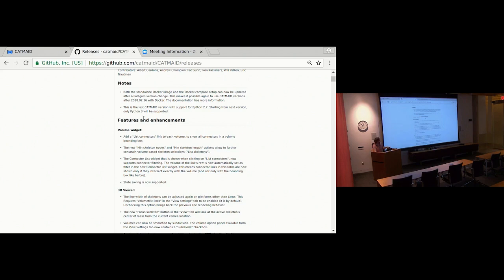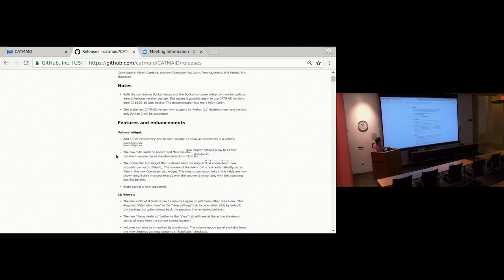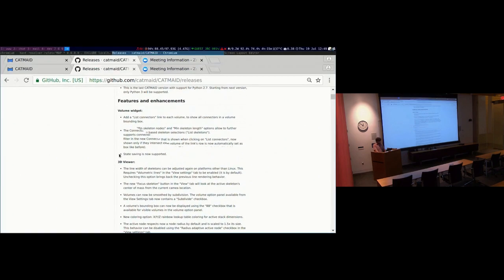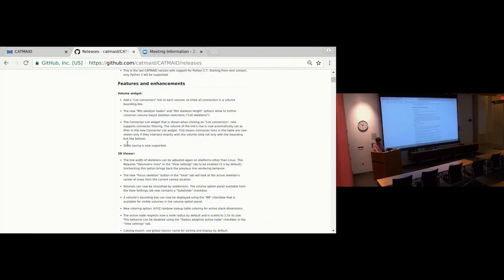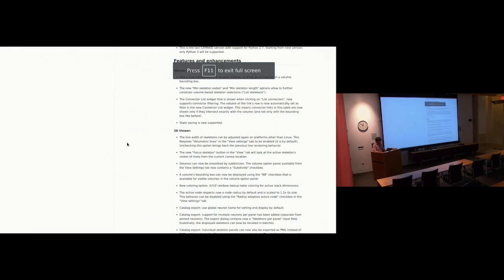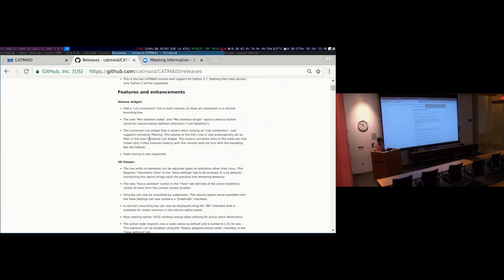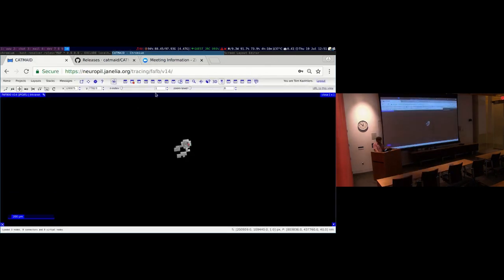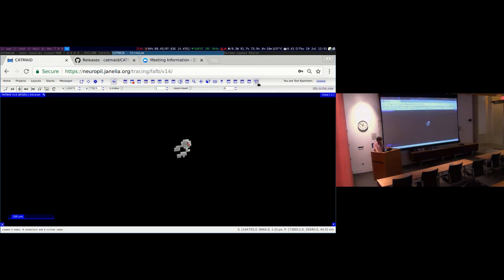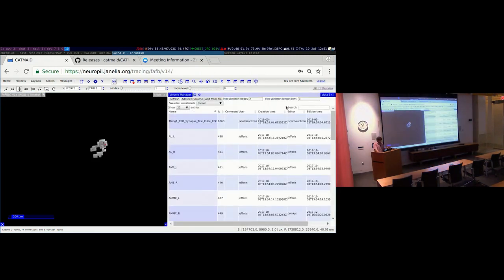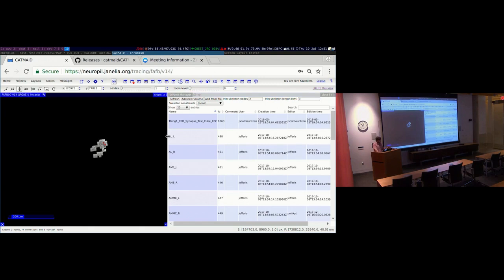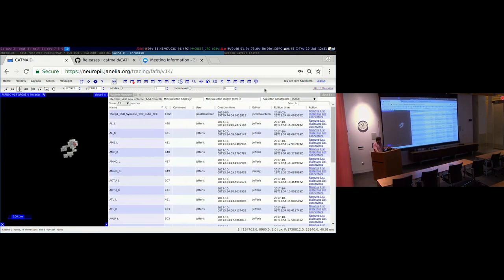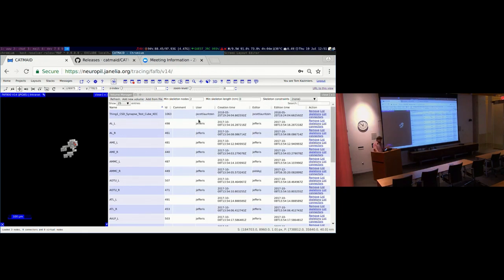So let's stick to this version's changes. Okay, so first changes are done in the volume manager as you might have seen. So that's FAFB v14 production instance, I'm going to use that as usual as an example. So in the volume manager, you now have a few more controls over here which allow you to intersect volumes with neurons or skeletons.